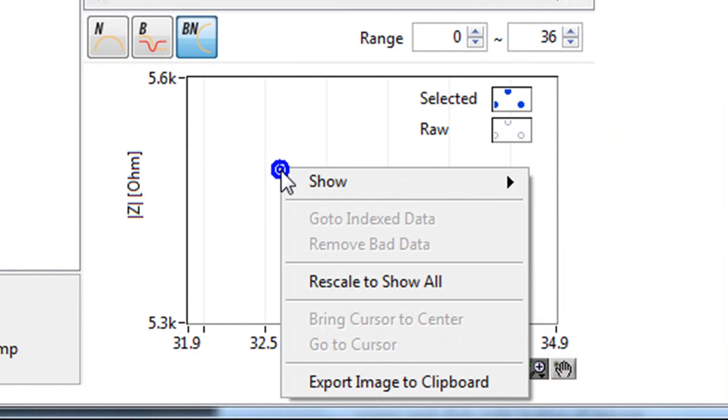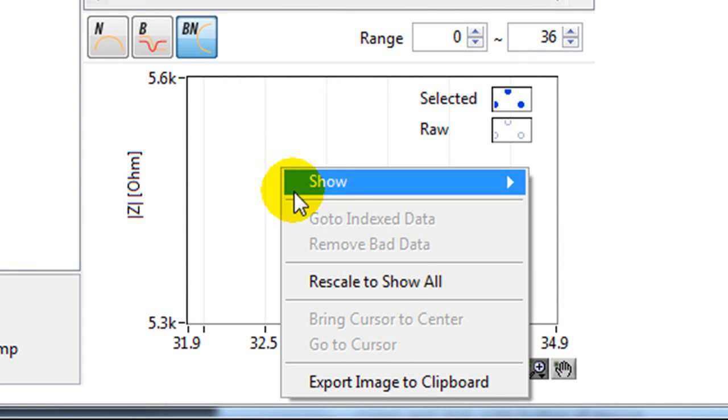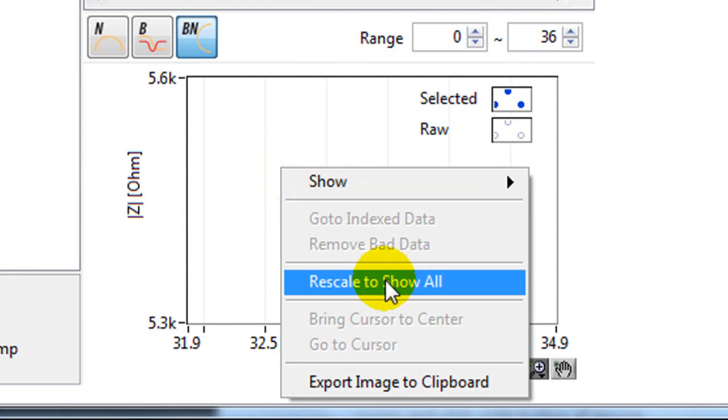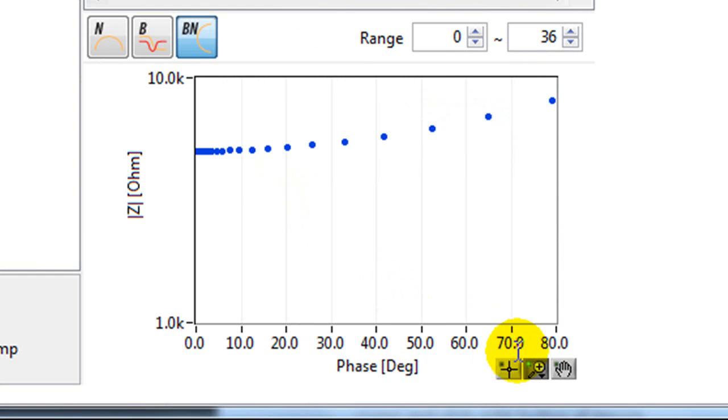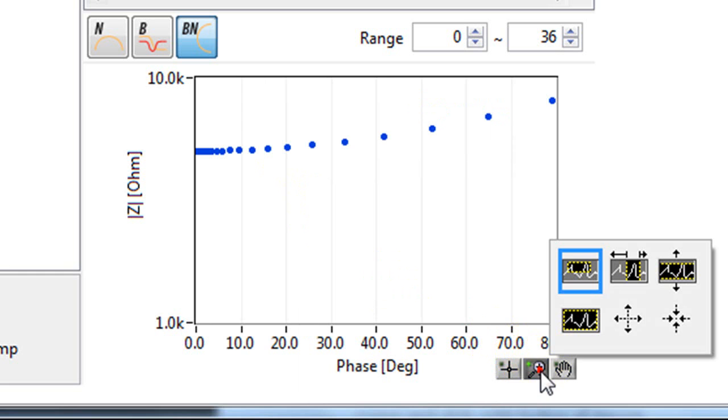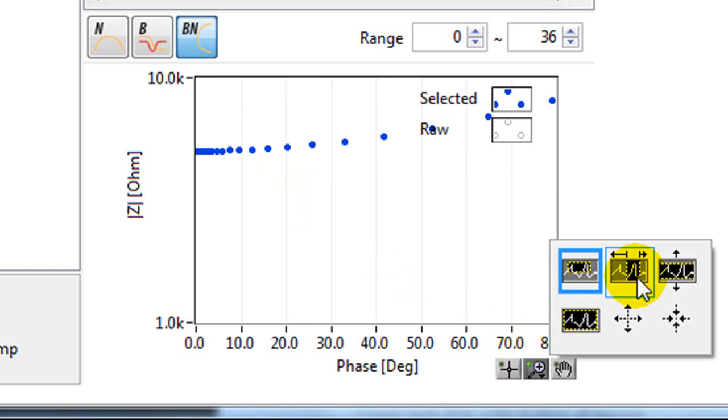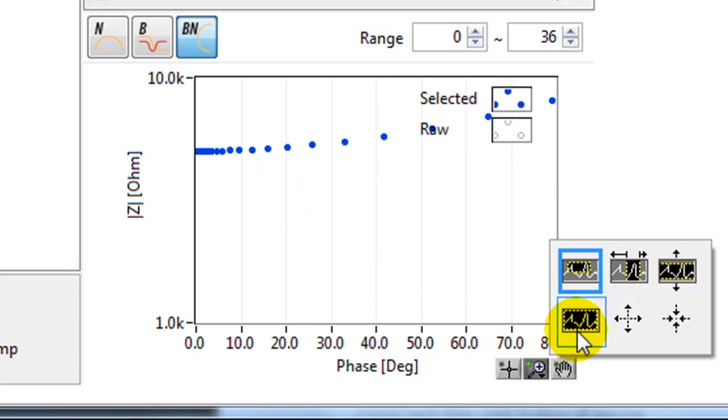If you want to get your data back, you can right click and rescale to show all. You can also zoom in just on the x axis or just on the y axis. This is to see all of your data.